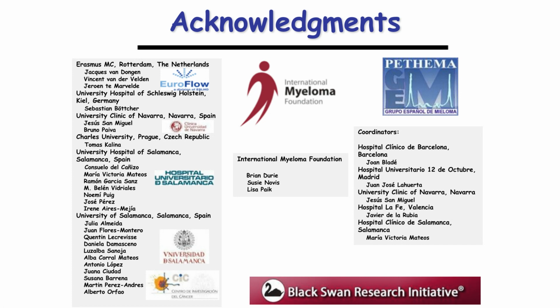If you have them well represented and you have a reference number for them at that specific time point and also that specific therapeutic regime, it would really help you to have a good idea whether the sample is hemodiluted or not. We are still searching for a more accurate and precise way to define this, but so far it has not been possible to get this approach right.